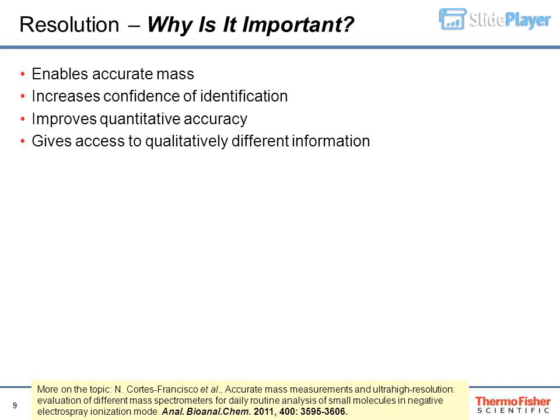The figure shows the detection of 2 species with a mass difference as small as 0.015 amu at different resolution settings on the Q-Exactive instrument. The 2 species are not resolved at 35,000 FWHM, which results in a mass shift and an inaccurate detection and quantitation for both species. The two species are separated to 50% valley at 70,000 resolution, and baseline separated at 140,000 resolution. Therefore, higher resolution, in this case 140,000 FWHM, allowed for more reliable identification and accurate quantitation.